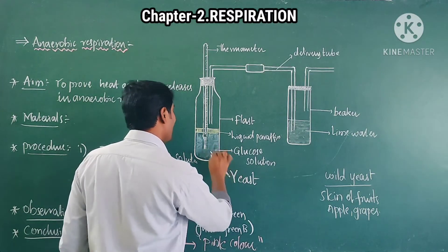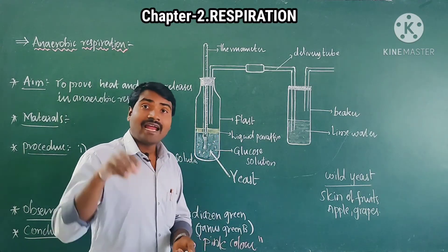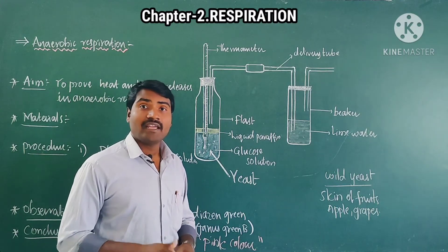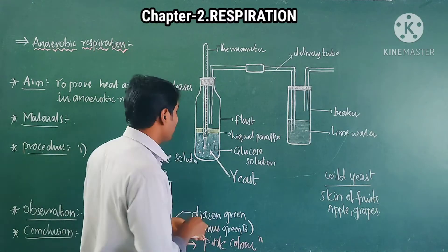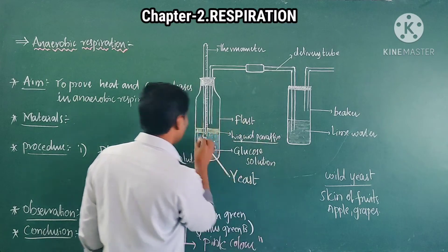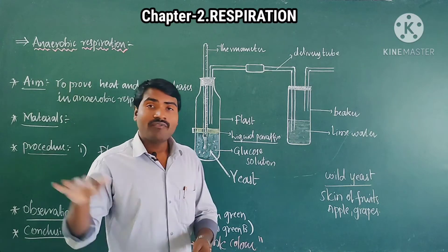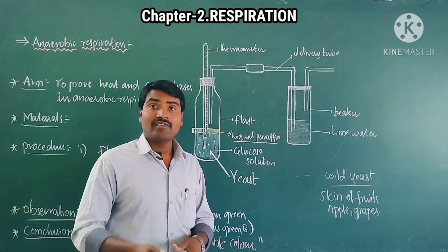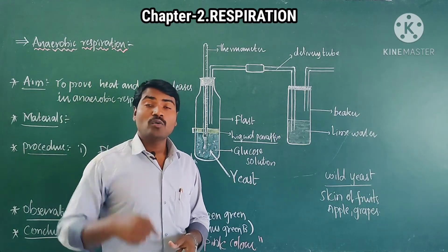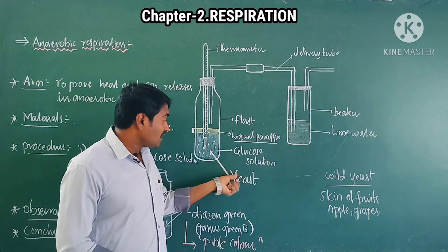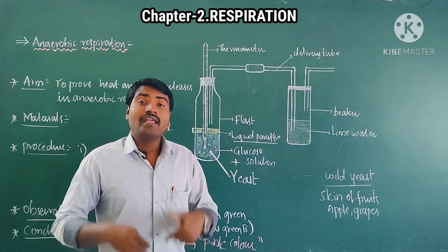After adding the yeast to the glucose solution, pour a one-inch layer of liquid paraffin over the solution. This liquid paraffin acts as a wax layer. We use liquid paraffin to prevent the entry of other gases — especially oxygen — into the glucose and yeast solution.